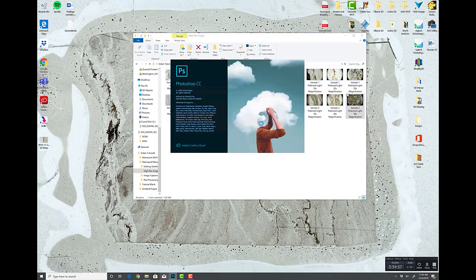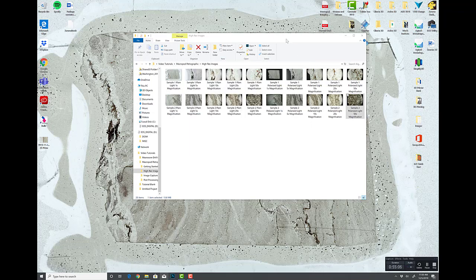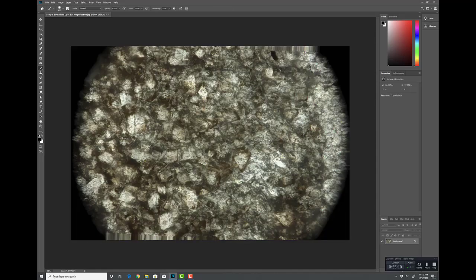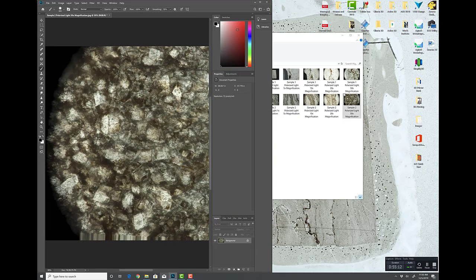Okay, somehow I just set that as my background. So whatever, we'll just leave that like that for now. Still getting used to PCs. Okay, so that's going to open up. We have all of our photos.